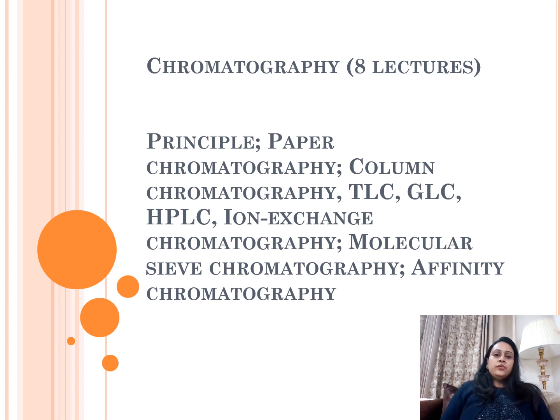There are various types of chromatography which we will be covering in this topic. We will be studying the principle, paper chromatography, thin layer chromatography, column chromatography, gas liquid chromatography, HPLC, ion exchange chromatography, molecular sieve, affinity chromatography, and all in this chapter.